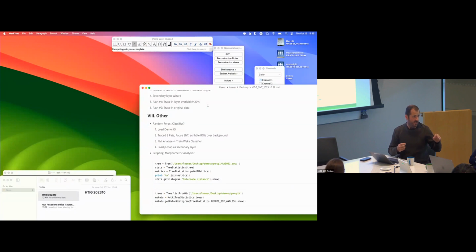Why is there a field manager and not the path manager? Because we were not sure the field manager would work, and so we created a different thing on the side, and then it just stayed on its own.